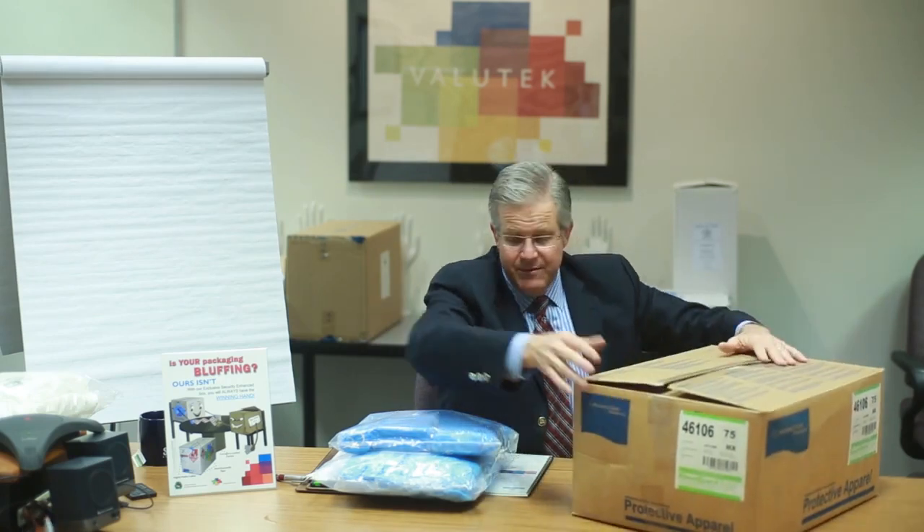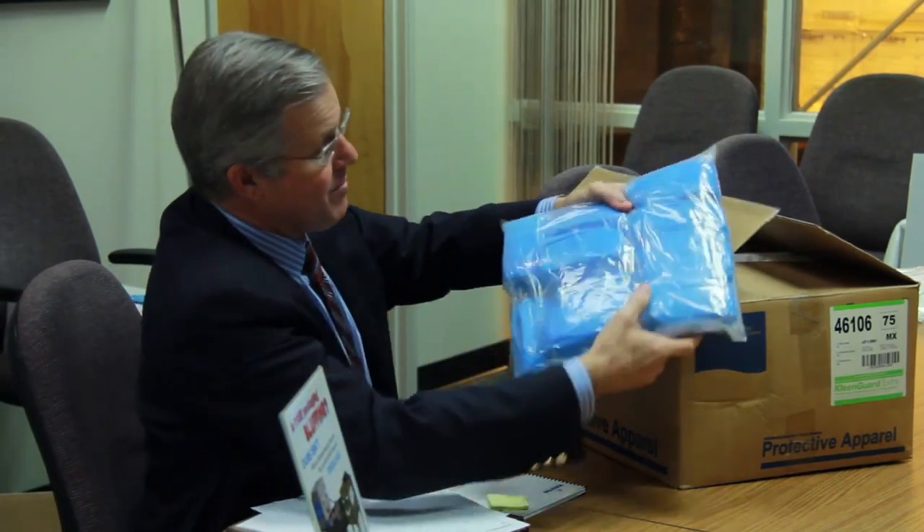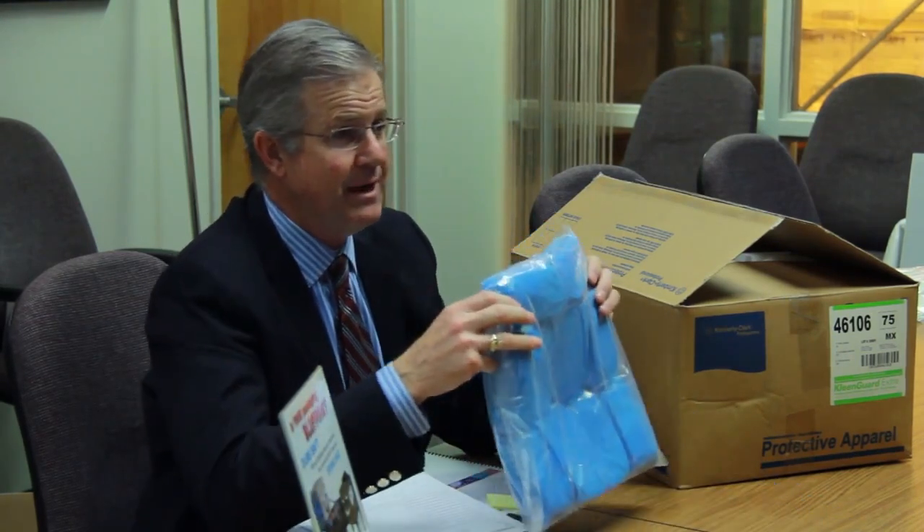I want to illustrate another example of a shoe cover. A common shoe cover used in the industry is the anti-skid polypropylene. Although this product is properly packaged in a bag within a bag, these are rolled up like pigs in a blanket. This is also what we would consider packaging that's bluffing — it's not cleanroom compatible, even though it's the most common type of shoe cover packaging. Because these shoe covers all need to be individually unrolled, it takes a lot of operator time and effort before they can be donned.